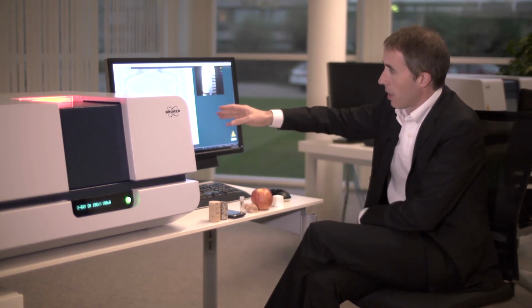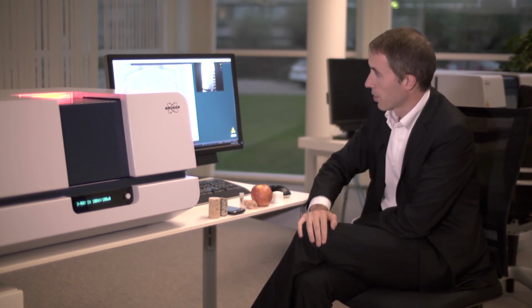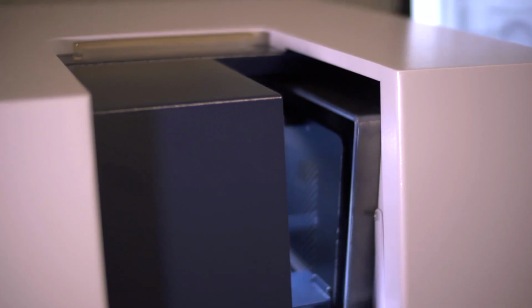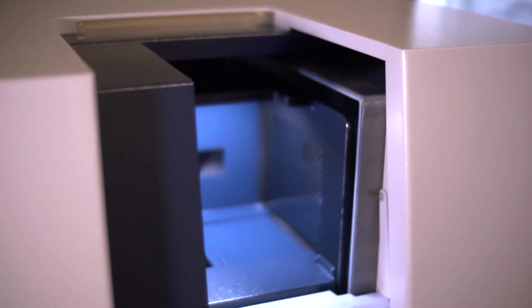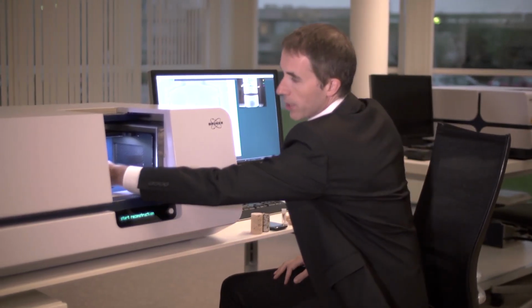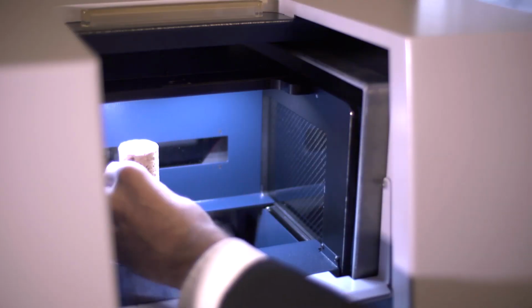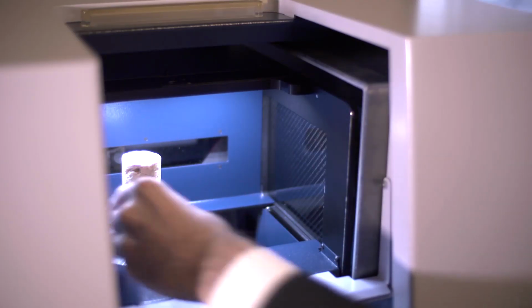So at this point in time, the scan is just finished, just a few seconds left. And as soon as the scan is finished, the scanner is already ready to place in your next object. The object becomes available. You can just take it out, put your next object inside, and again with a single push of the button you can scan your next object.